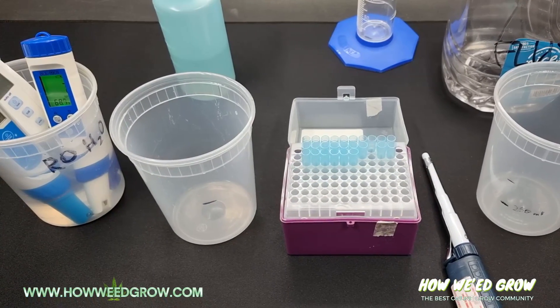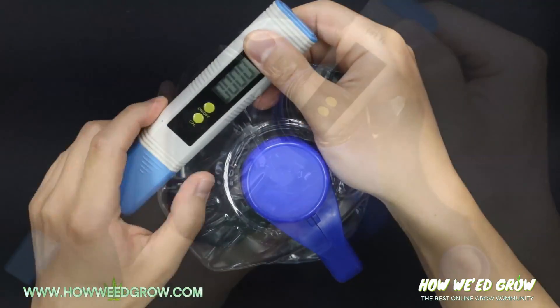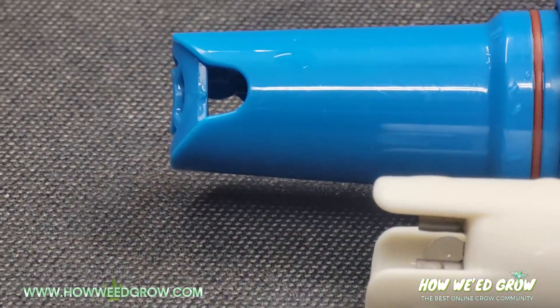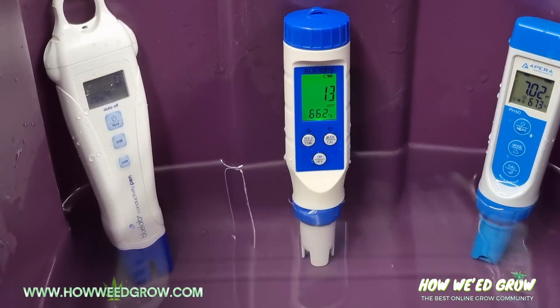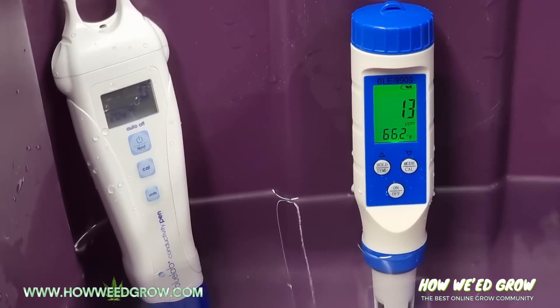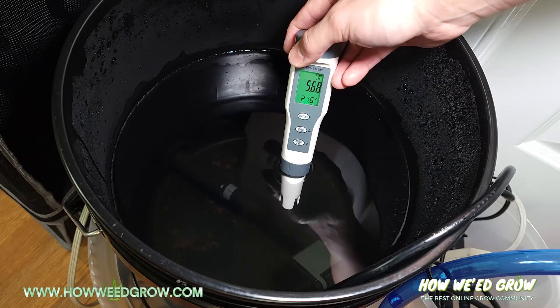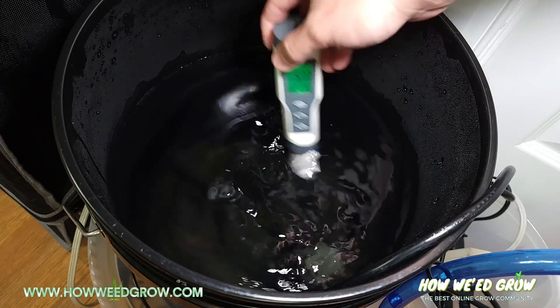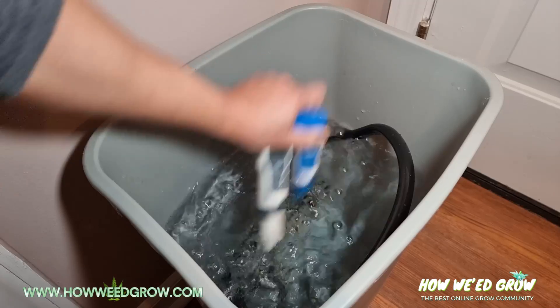A common myth is that you can store your probes in reverse osmosis, distilled, or deionized water. This is absolutely not true and it's just as bad as letting the probe dry, because purified water has all of the particles that could potentially hold ions removed. This lack of ions results in the same defects as when a probe is left out to dry. Just know that the only time pure water is used around pH meters is for rinsing.